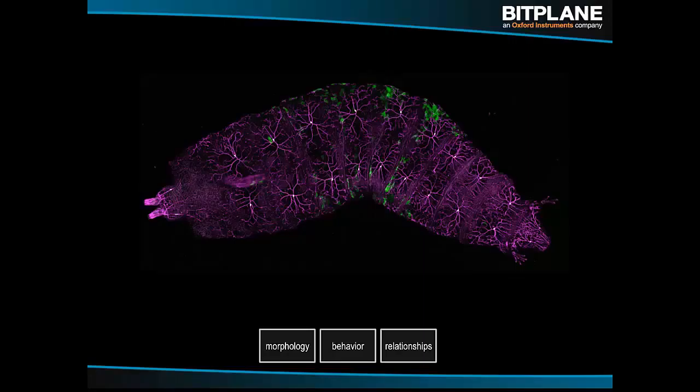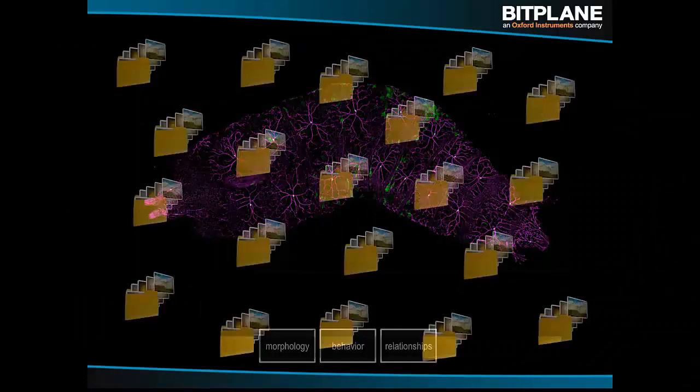But we realized that this is definitely not enough. It's very, very rare that you can write a science paper based on one image or even a couple of images. It's not the case, unless you're developing a microscope and then all you have is one image at the end to say, hey, my microscope works, that's enough. But for your clients, if you're a facility manager, they normally have hundreds of images, if not thousands of images. And so the problem becomes a little bit more tricky to solve.